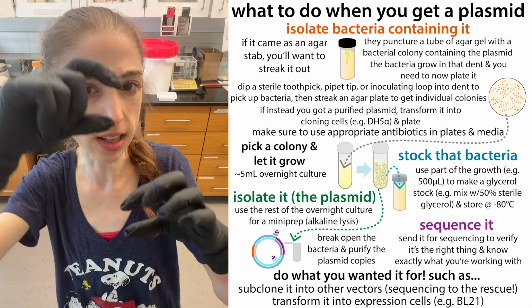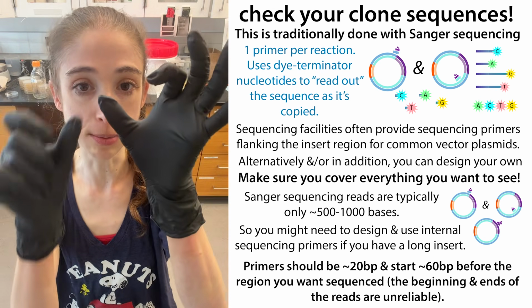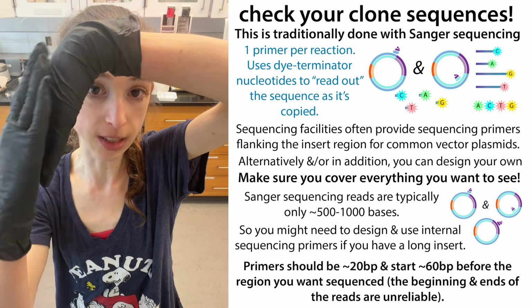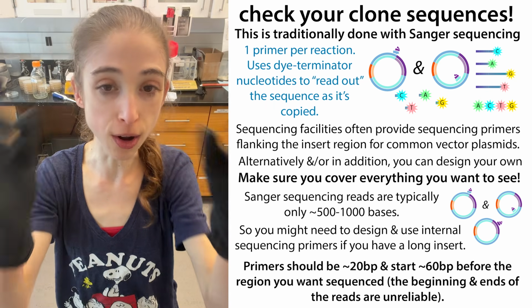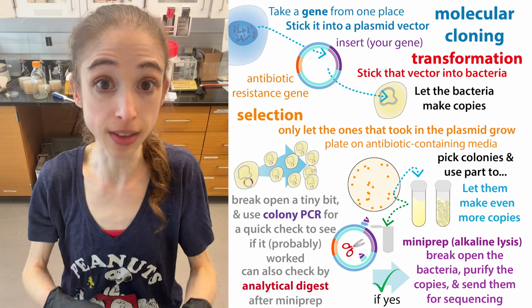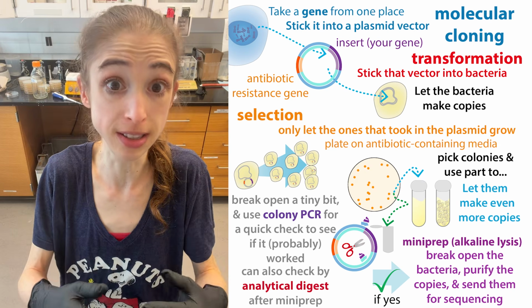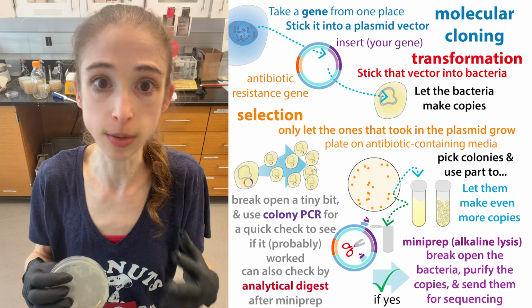It used to be that if you wanted the whole plasmid sequence, you had to use multiple primer pairs, because they would do primer-based methods where you just amplify specific regions of DNA, and the reads weren't long enough for you to go all the way around. But now there are whole plasmid sequencing options where they'll sequence the whole plasmid, and you don't even need to give them primers. It's not really that much more expensive, especially if you wanted to sequence the entire plasmid. It's like a cheaper option. Easier, cheaper, we go for that.